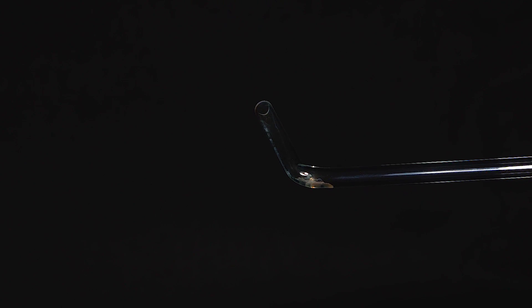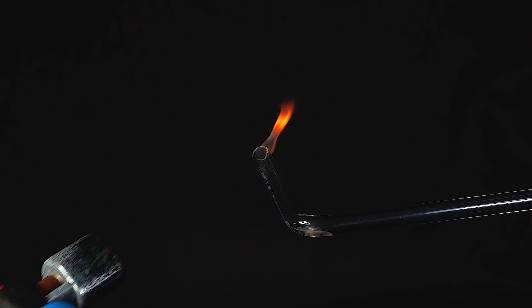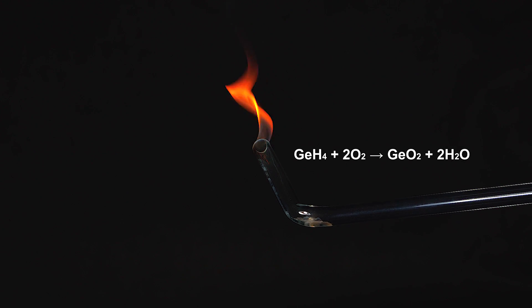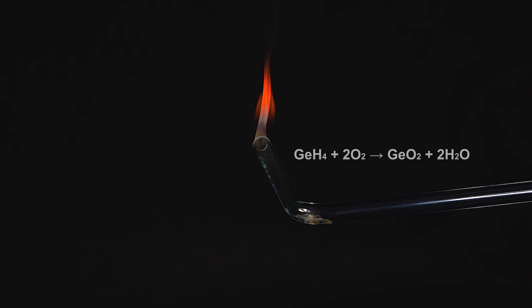In air germane burns in orange-red color. However, its combustion is interrupted due to the presence of argon in the mixture with germane and due to the lack of oxygen. This white smoke that forms during the combustion represents germanium dioxide.